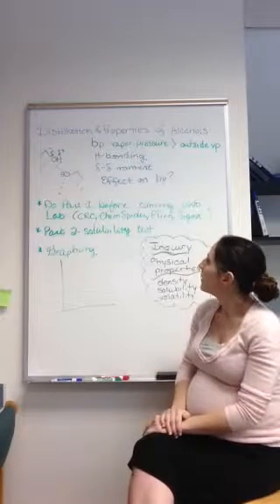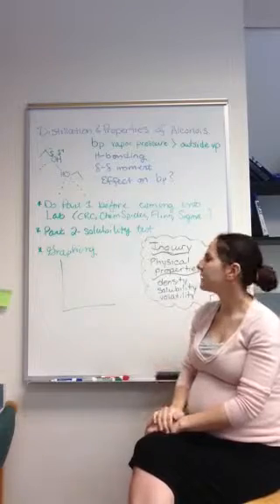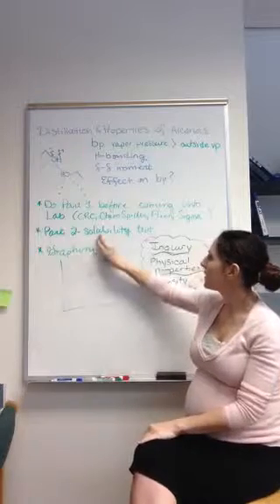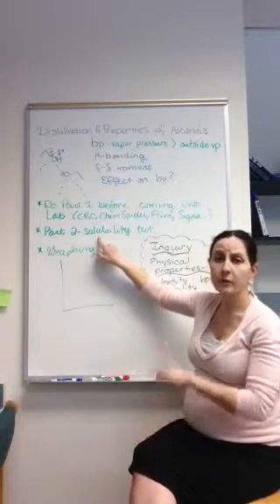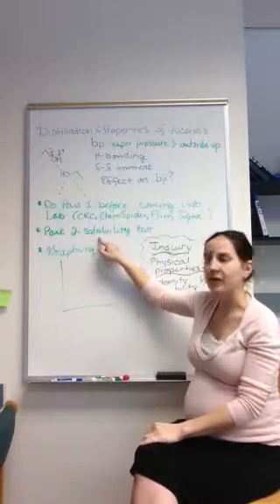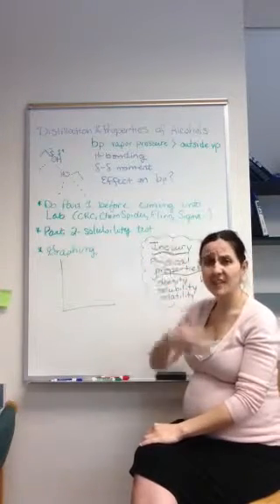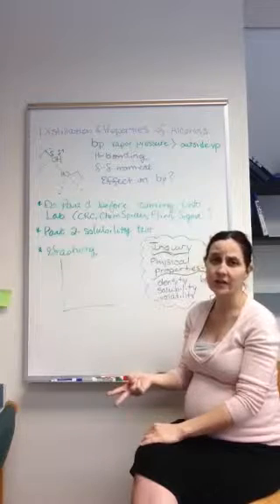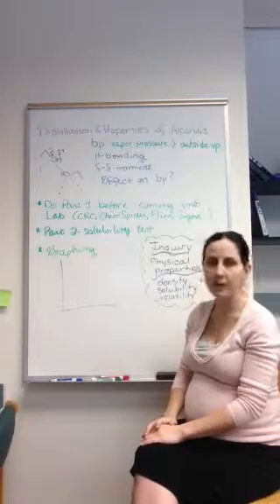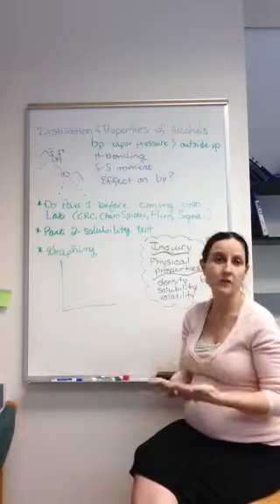some sort of reference, so that I know where you've been. So part 2, in this lab you're doing a solubility test, and this is very similar to the one that you did in lab number 1. A couple of things we want to think about. If something is soluble, you won't see an interface, a dividing line between your two liquids. You'll just see clear and colorless liquid, and it won't look hazy. That means the two substances dissolve, or your solute dissolves in your solvent.